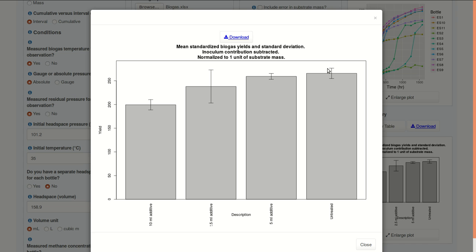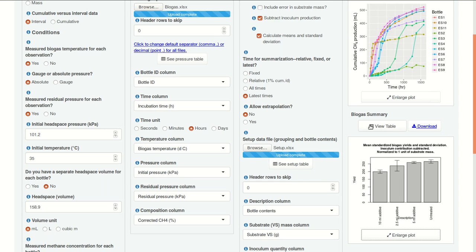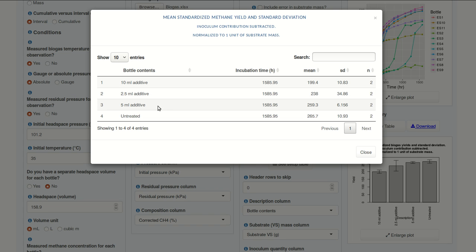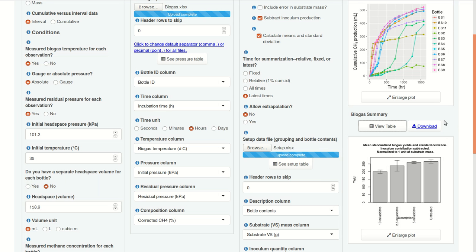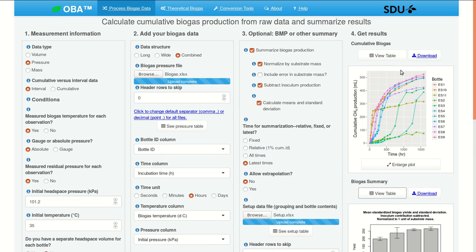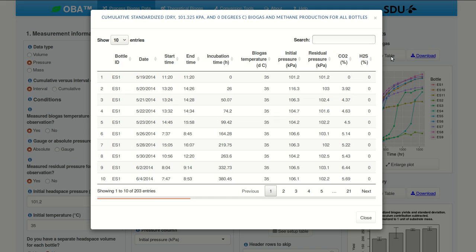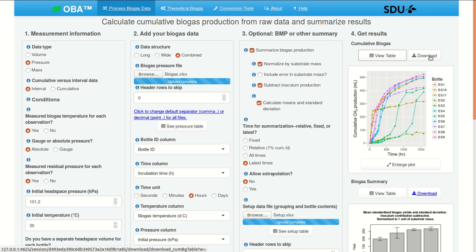The highest BMP is actually from the untreated control, and it looks like the additive probably suppressed biogas production. We can see the numeric results as well. So for each of these conditions we have two bottles, and this table gives the mean BMP and the standard deviation for each of these conditions. We can download these data as a CSV file by clicking here, and we can also download the more detailed cumulative methane production results, the data that are not summarized by clicking this link here.